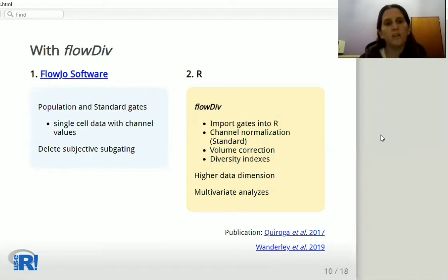With FlowDiv, we only need to generate the gates for the population and the standard. Here we delete the subjective subgating.